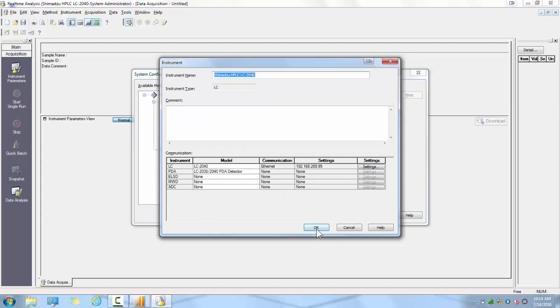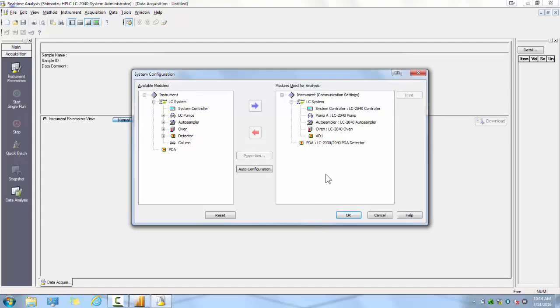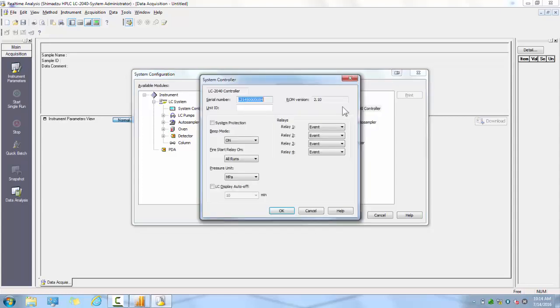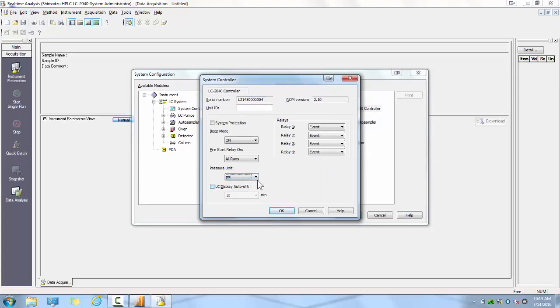Each individual module listed in your hardware configuration can be individually configured. You can see each of the options for each module by double-clicking on it. In the case of the LC2040 system controller, you have options for beep mode, fire start, pressure units, and relay options.